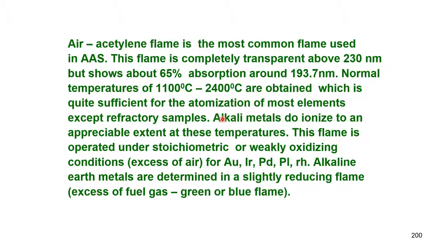air-acetylene is the most common flame used in AAS. This flame is completely transparent above 230 nanometers. That means it has no background. The air-acetylene does not show any absorbance of its own molecular species or the refractory oxides.